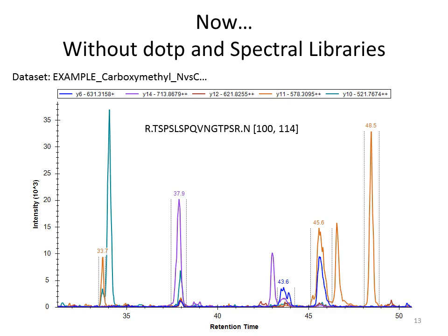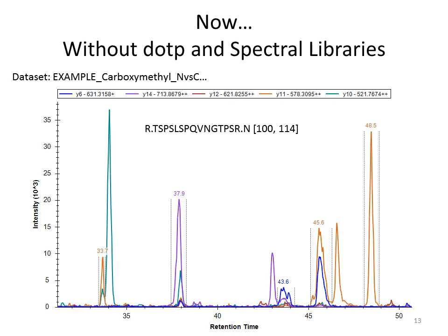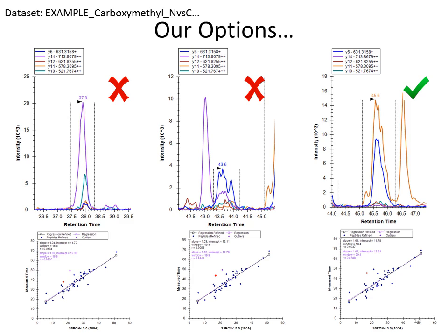Now this one, it could have been, maybe, because everything is lifting off a little bit, but not as good as that 37.9. Oh, yeah. So we weren't right. So here we are looking at the data zoomed out, and the 37.9 actually looks pretty decent. But when you zoom in, what do you notice about it? There's like, that purple one might not actually be part of this one, so it could be an interference, or it could be a mixture of things, and that's where it is on the retention timeline.